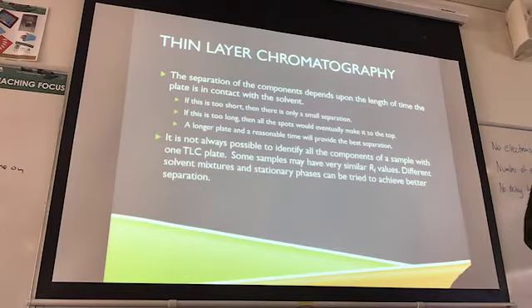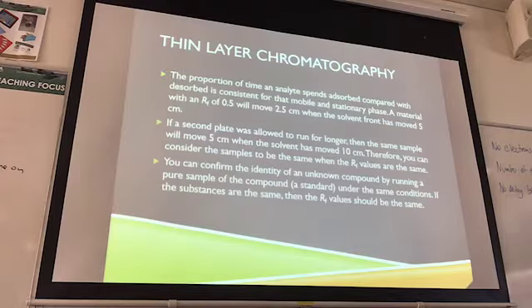So sometimes you need to experiment with the solvent that you're using, because different solvents or different stationary phases will allow better separation of the analyte that you're analysing. The amount of time that the analyte spends adsorbed compared to desorbed is consistent with that particular set of stationary phase and mobile phases.